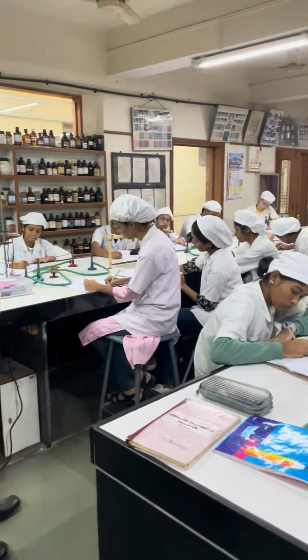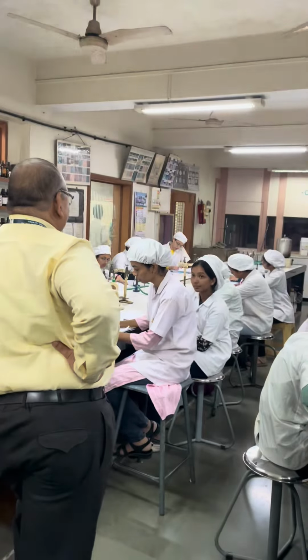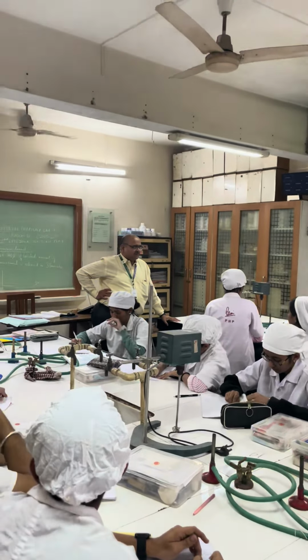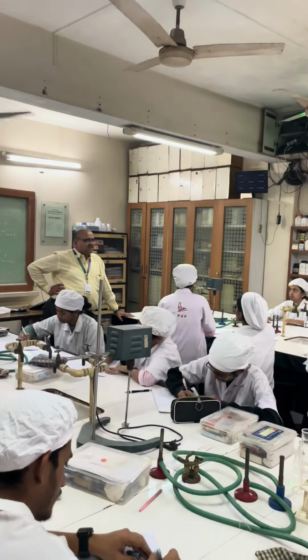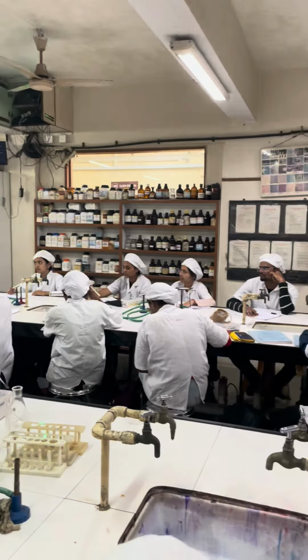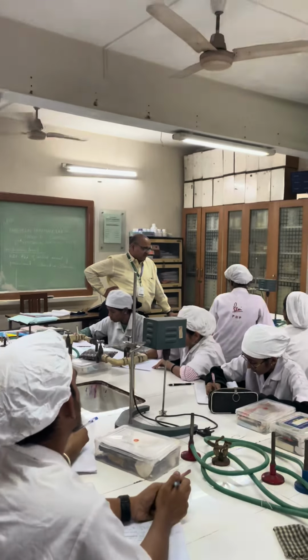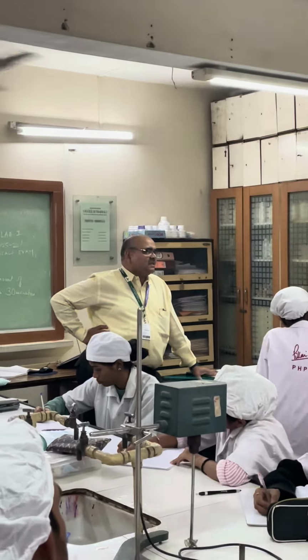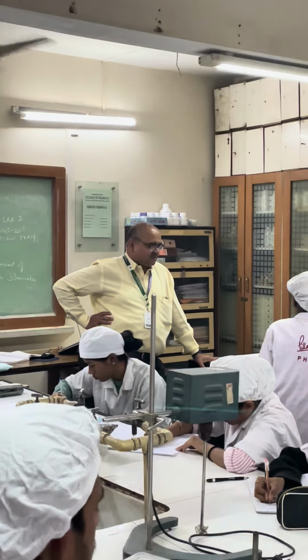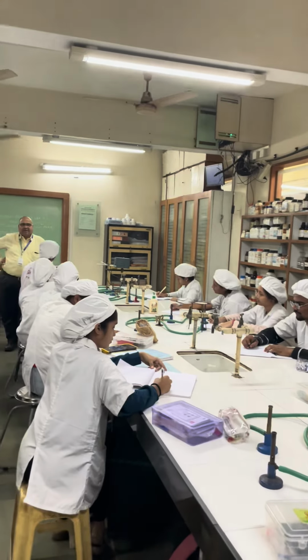Now to do this presumptive test, lactose fermentation broth is the medium used, of which I have told the composition, and you have already put it in the autoclave for sterilization. After autoclaving, you will get the sterile lactose fermentation broth test tubes. Using those test tubes, you will perform MPN, that is the presumptive test. Now this test is based on statistical sampling theory. Water collected from one source at different time intervals is supposed to contain similar types of organisms. The practical has been based on this.